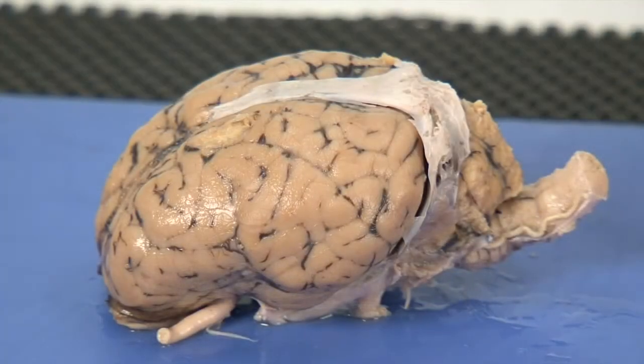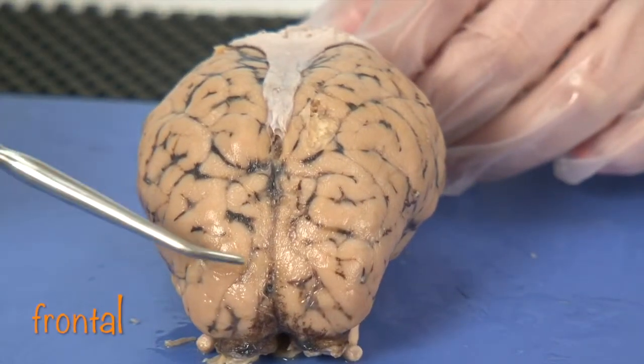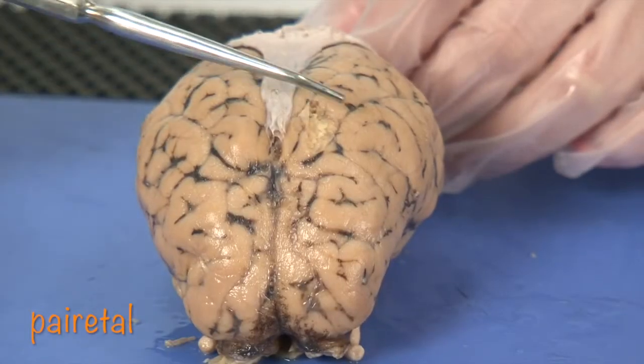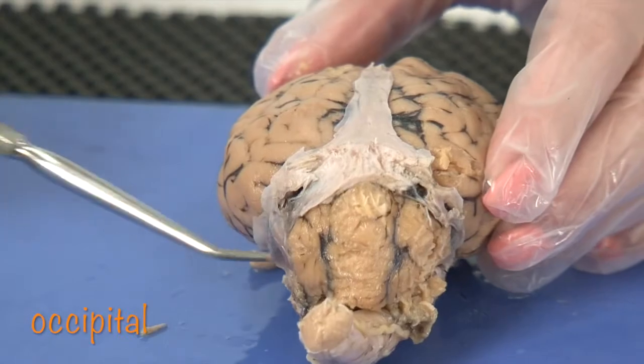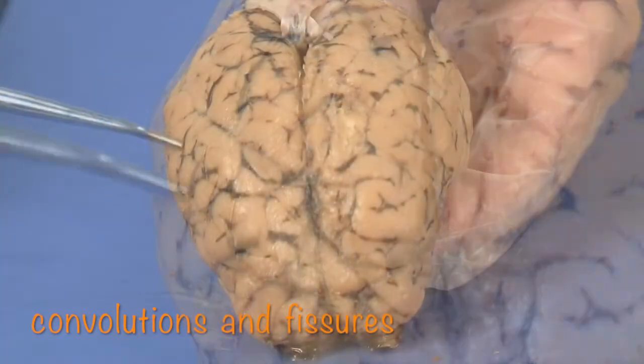Note that each lobe is found in each hemisphere. Identify the frontal lobes, parietal lobes, temporal lobes, occipital lobes. Look at the outer surface of the brain. Notice the convolutions and fissures.